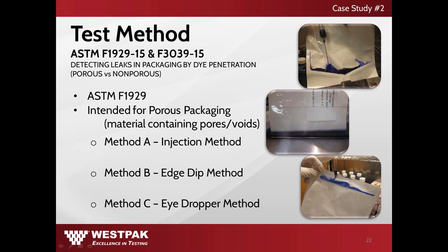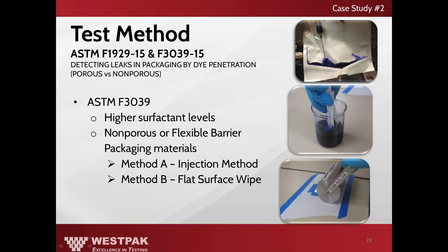Dye penetration for porous packaging is outlined in ASTM F1929. The three methods include method A, the injection method; method B, the edge dip method; and method C, the eyedropper method. For non-porous packaging such as foil and poly pouches, ASTM standard F3039 is referenced. For this test, the dye penetration solution is made with a higher surfactant level in order to indicate channel leaks. The two test methods included are method A, the injection method, and method B, the flat surface wipe method.